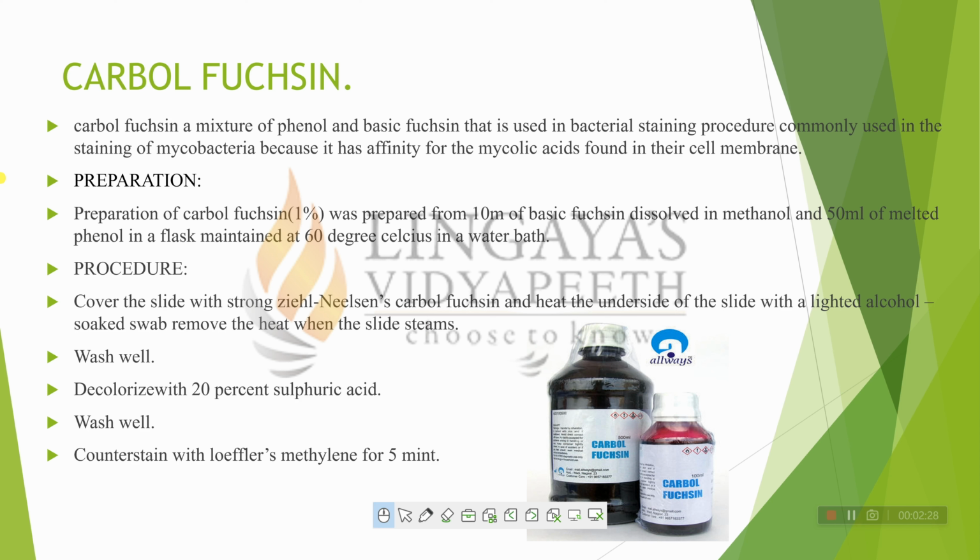Carbol fuchsin is a basic dye which forms a yellow-brown compound in the presence of acid. It is mainly required for the staining of mycobacteria. The waxy walls of mycobacteria help in retaining the dye within the cell, and it can also be used for the staining of bacterial spores. So it is a mixture of basic fuchsin and phenol. It comes under the hazards of acute toxicity, inhalation, oral, aquatic chronic, etc.